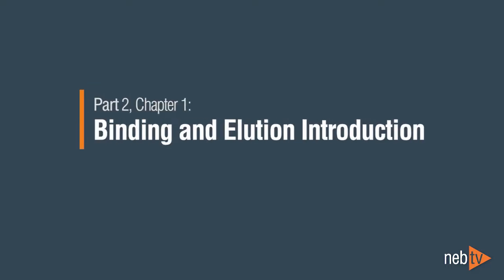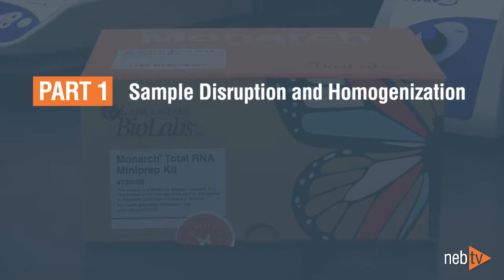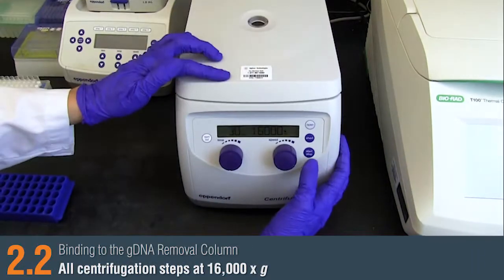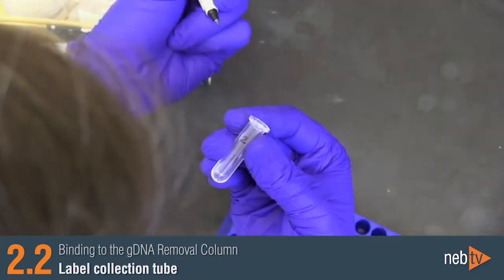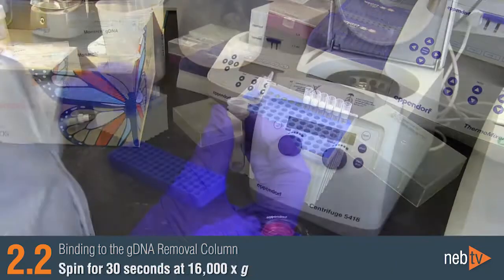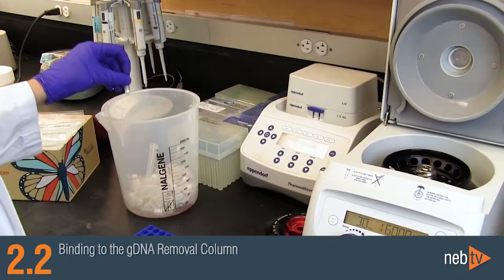Part 2: RNA binding and elution. RNA purification using the Monarch Total RNA MiniPrep Kit is divided into two parts: sample disruption and homogenization, and RNA binding and elution. By now, you should have viewed the video for Part 1 relevant to your sample type. If working with whole blood samples, please proceed directly to Binding to the RNA Purification Column. For all others, add up to 800 microliters of lysate from Part 1 to the Genomic DNA Removal Column (the column with the light blue ring) and spin for 30 seconds. This column binds a large majority of the gDNA present in the sample, allowing the RNA to flow through. Discard the column and save the flow-through, as this contains your RNA.